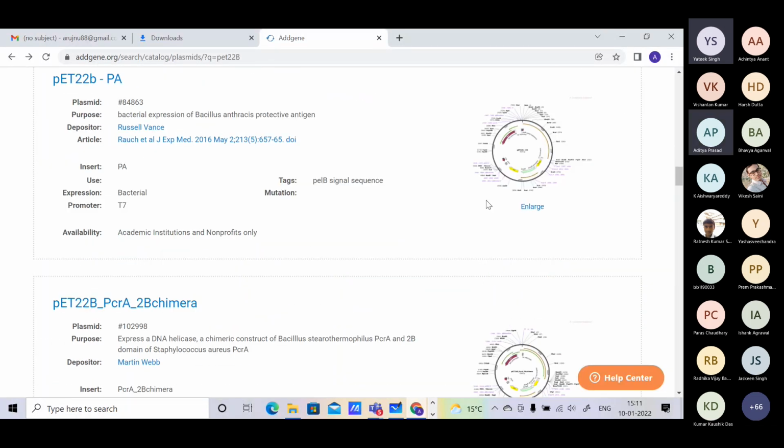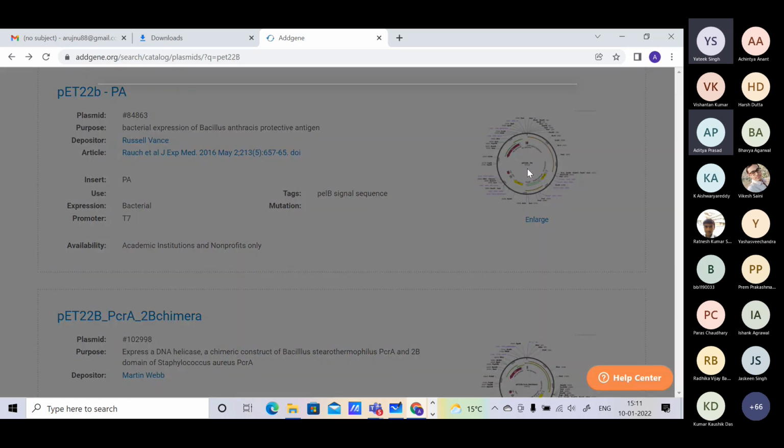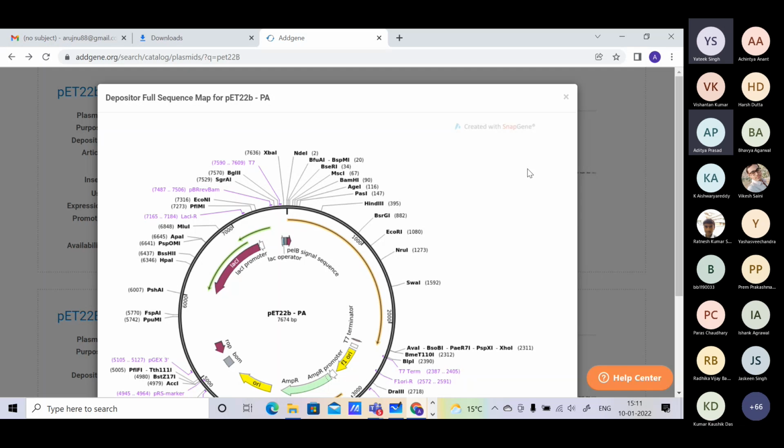I had a question, sir. In the inoculation plate that ma'am showed previously, are all the colonies having the same vector and the same insert? Yes, it is the same throughout. Then why is it making so many? Okay, so the thing is, what do we mean by the word clone? The word clone itself means an exact copy of each other, right?